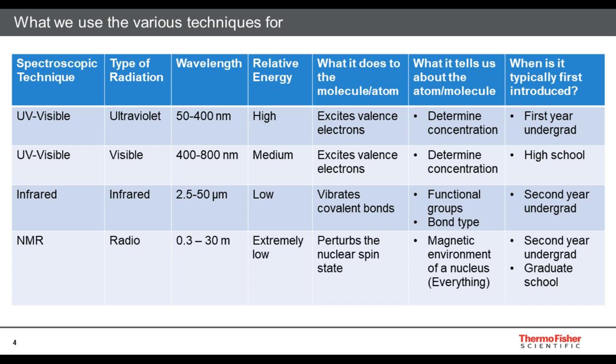Infrared, as I said, comes in that second year undergrad. This is a lower energy radiation source in the infrared.